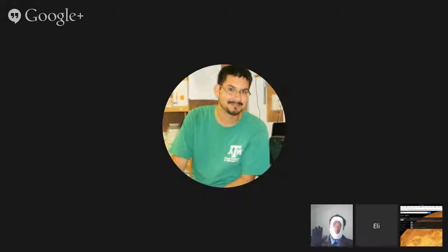the FASTQ? What's it called? Yeah, the FASTQ files. I don't actually need it because I don't need to download them again, but I was just going to point out everything on there. Here, I'll email it to you right now. Oh, okay. Or you can just put it in the chat here.